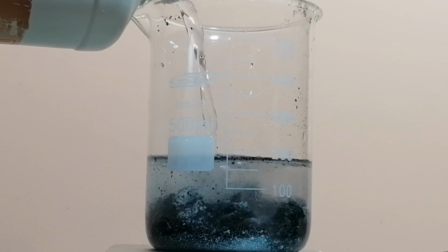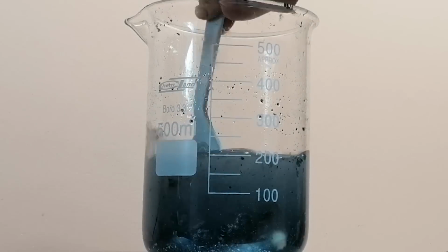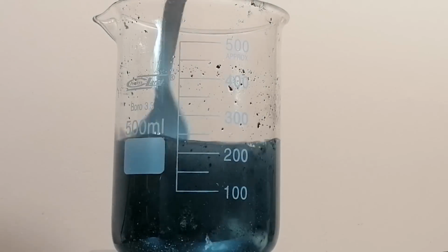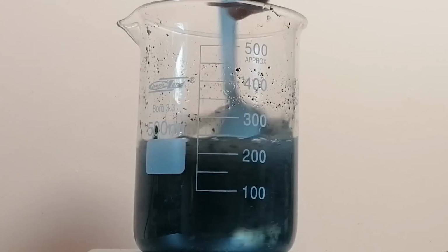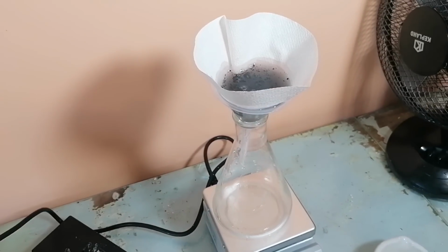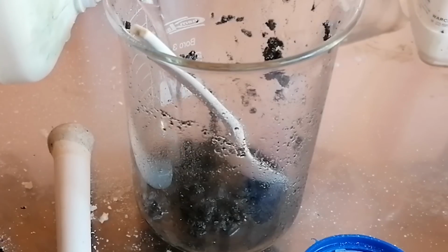Then I've added some HCl. I've tried to turn on the stirring, but sadly the stir bar ended up just having a stroke. The reason why we're using HCl is to convert any unreacted magnesium and the resulting magnesium oxide into a water-soluble form. Here's me filtering the acid washed boron into a beaker. This is the final washing where I add concentrated hydrochloric acid.